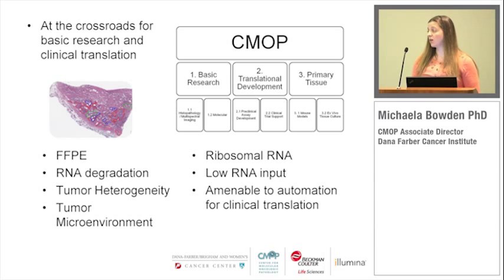Most of the studies we're involved in are primarily around looking at tumor heterogeneity and the tumor microenvironment. In the tissue section on the left-hand side, you can see these areas are very small within the tissue confines, which also limits the amount of tissue you can use. So the big push here is smaller amounts of RNA input for a library, being able to automate it, and do this with fast turnaround and high throughput volume, which isn't traditionally known with this type of application. FFPE tissues are the holy grail for clinical diagnostics.